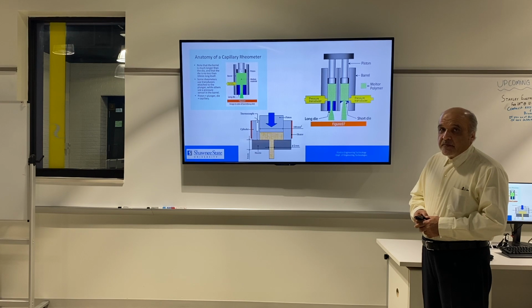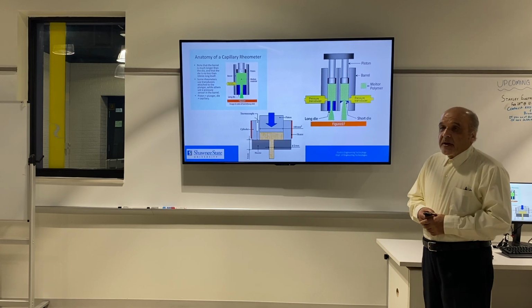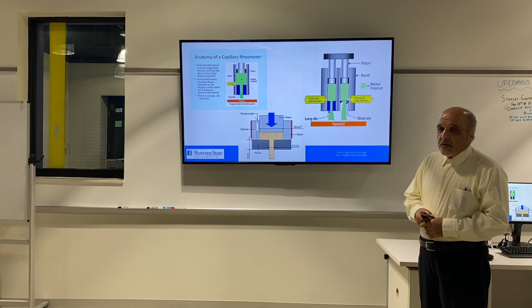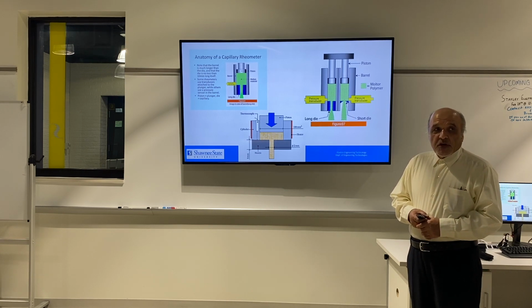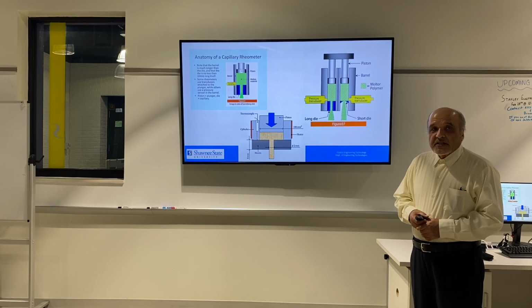Even for the lab, you will receive some type of lecture regarding how to do the experiment or how to provide your report. Actually, I'm going to eliminate the last lab report, so you are going to finish only one more lab report, which I provide for DSC, differential scanning calorimetry, and TGA.